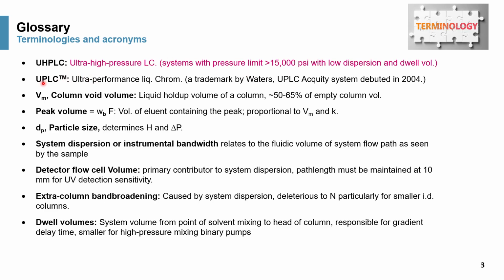Now, UHPLC should not be confused with UPLC, which is a very common misconception, because UPLC, standing for Ultra Performance Liquid Chromatography, is a trademark from Waters, meaning the Waters Acquity System, which is the first commercial system, debuted in 2004. So if you say UPLC, you really mean the Waters Acquity System.